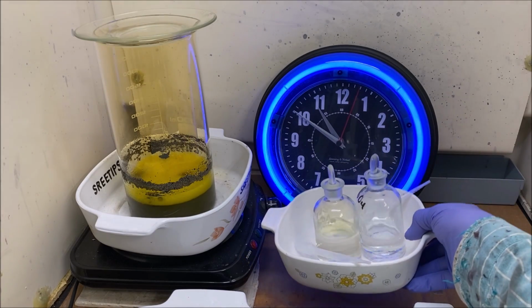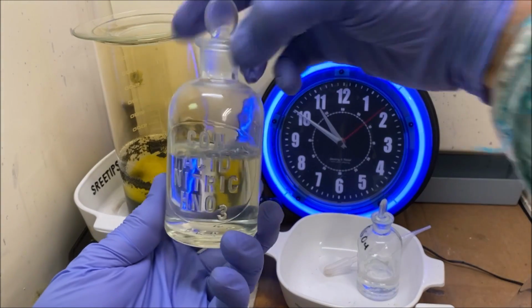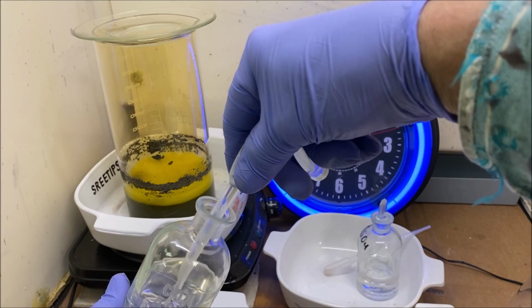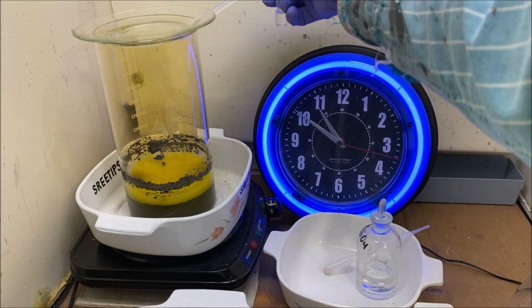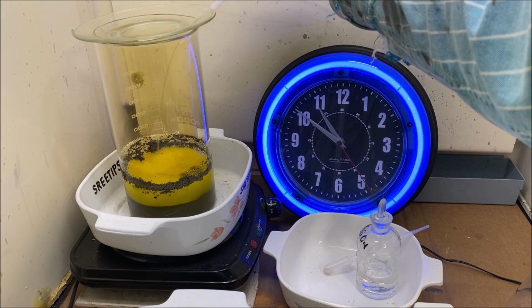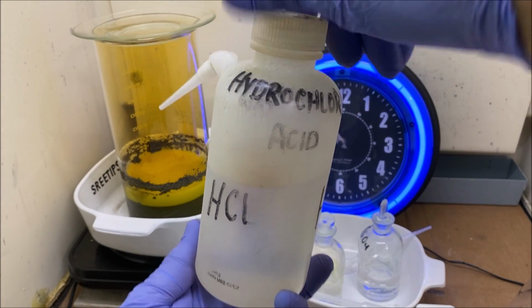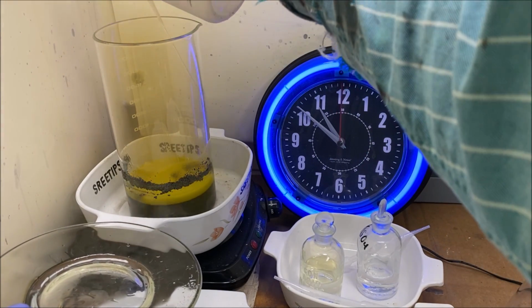I think all that nitric has become expended. Let's shoot another 3 milliliters in here and see what happens. A little bit of reaction, but not much. Now we'll use some hydrochloric acid to rinse down the sides of our beaker.